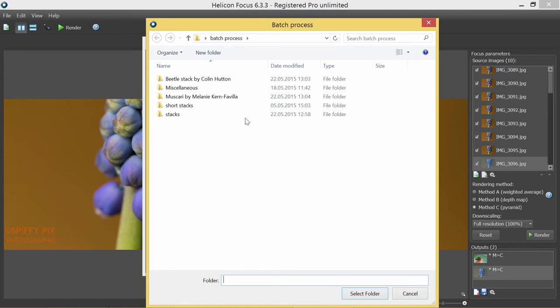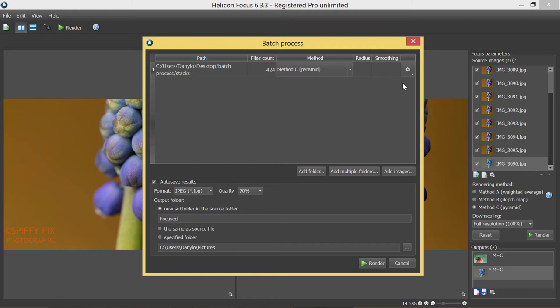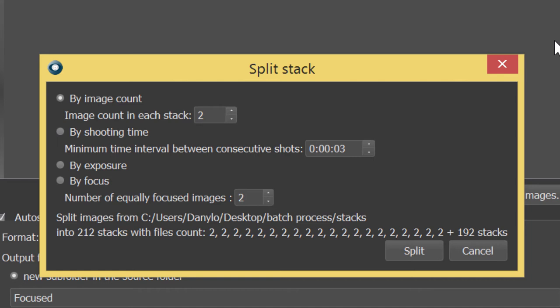Here you can choose among four splitting principles. The first one is the number of images in each stack. It's good for those cases when you have stacks with the same number of shots in each. The second principle is splitting by shooting time. This one splits the stacks by the minimum time interval between them. When I shoot, the pause between the stacks is normally no less than 3 to 4 seconds.